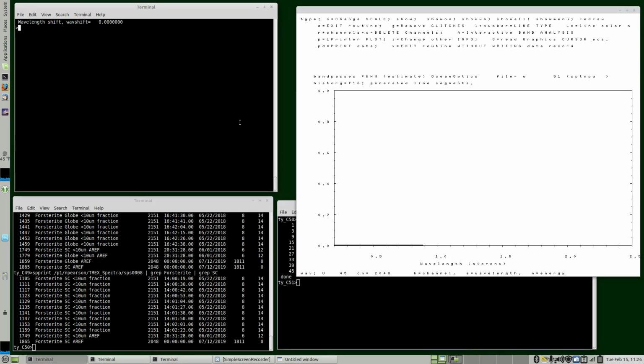Okay, so we've made this operation and created this data, but we have not written the data to the file yet. It's sitting in memory. So if we E out of the plot routine, there's a pending operation. It's called the soft exit from the current subroutine, and then the data will be written.